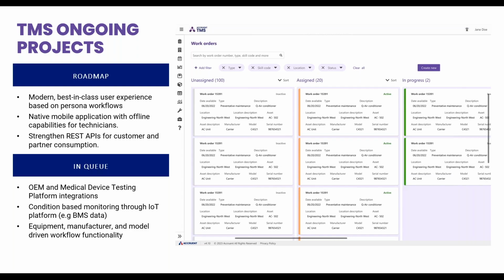Okay, well, that's part of it, right? Oh, I got 3 of them. Okay, we'll do 3 procedures. I don't care. You'll be able to set up these default functions by multiple values so that TMS is smart enough to get into the hands of your tech exactly what they need to do and eliminate them having to fish for it, find it, maybe find the wrong one, that kind of stuff.